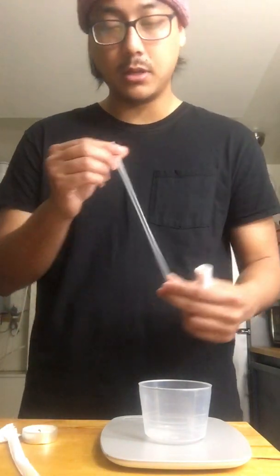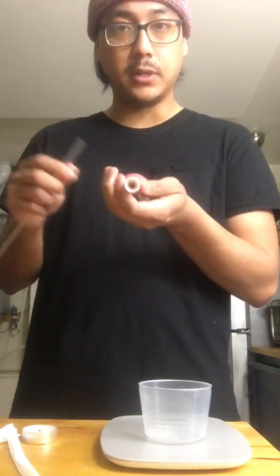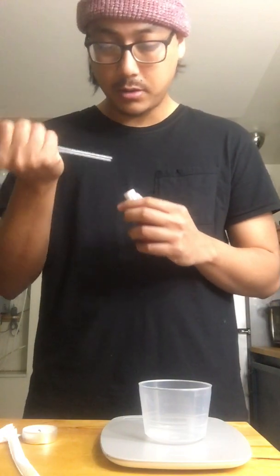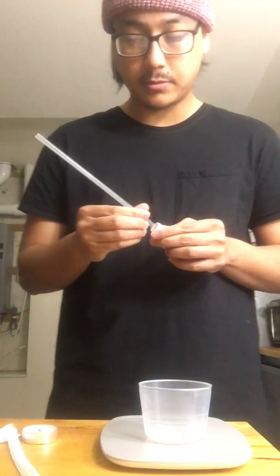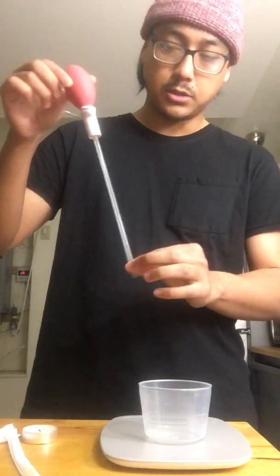Any straw works, but these nice fast food straws that are relatively wider in circumference are nice because they fit nicely into the rubber gasket inside of the pipette. Basically jam this inside until it makes a nice secure fit. It should hold like that — if you tug on it, it shouldn't come out.